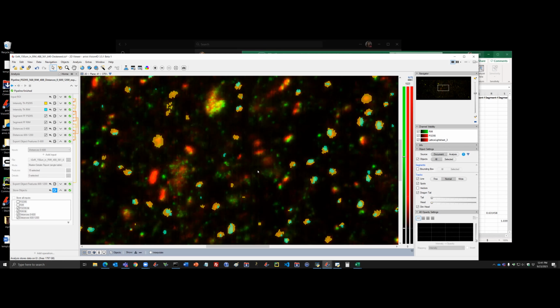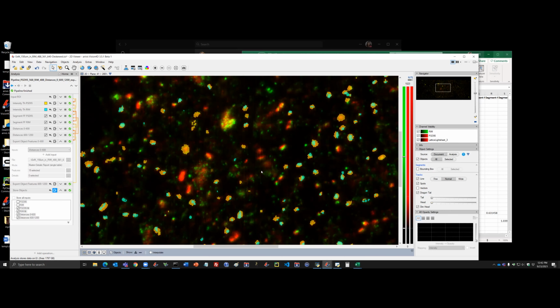And yes, we have been working on this from 2 fronts. From one side, we have a developers team working on the long-term solution to create a new module, but very recently we also had a new script developed by one of our colleagues, which creates a skeletonization of all the vasculatures, so they would look like 1 voxel thick lines that can later be computed.